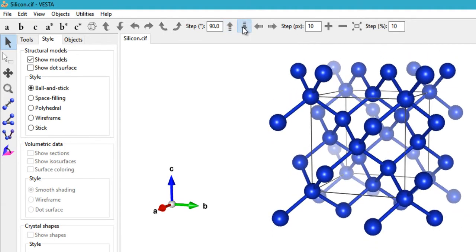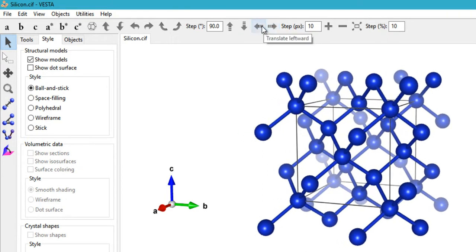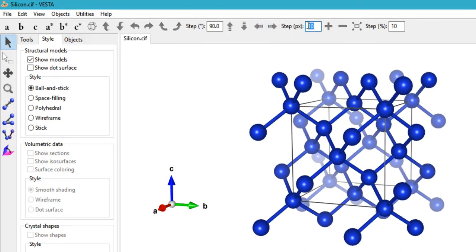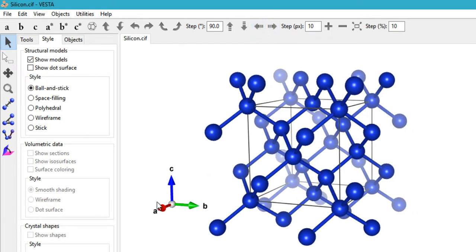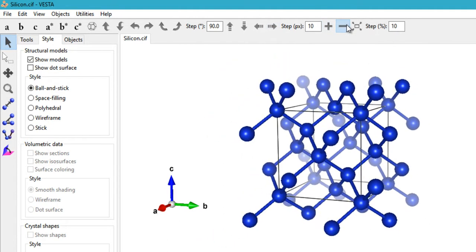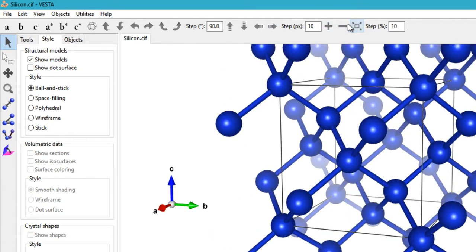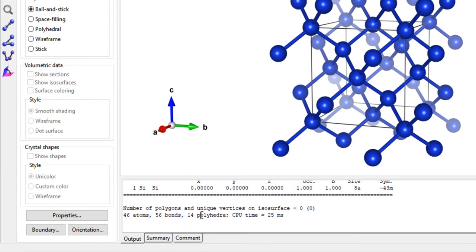You can translate the crystal upwards and downwards, and also leftwards and rightwards. You can set the step width in pixels. I tend to translate the crystal near the axis and then take a snapshot for research papers. You also have a zoom-in button, zoom-out button, a fit-to-screen button, and a step width setting. That covers the upper toolbar.